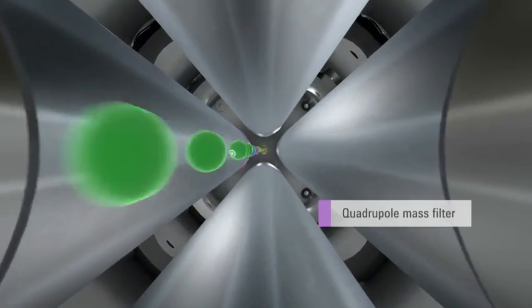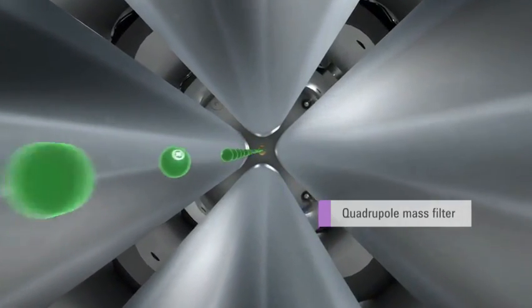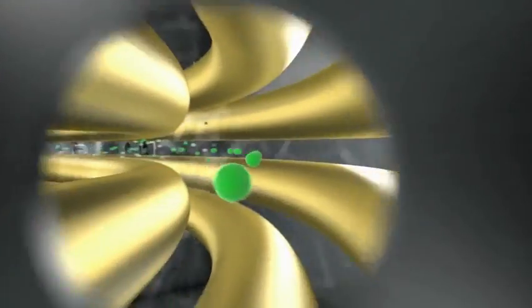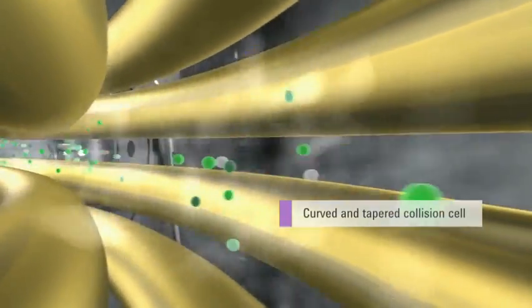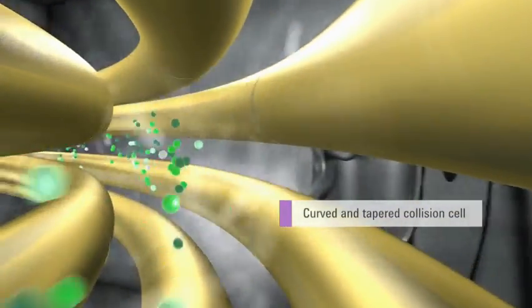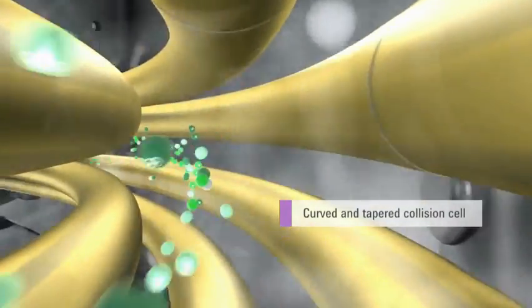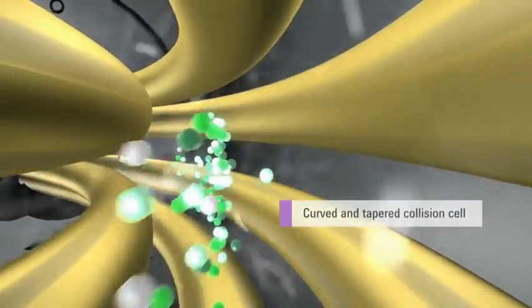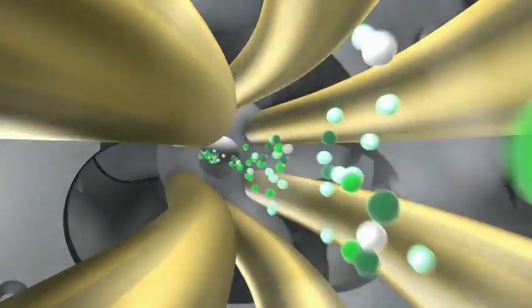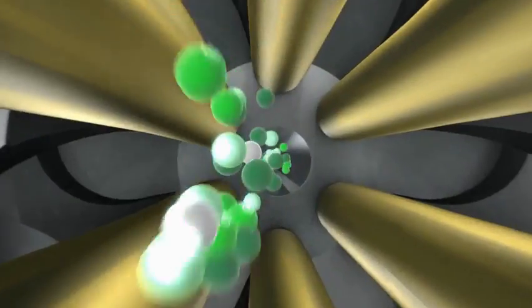The first quadrupole mass filter allows only ions of the target mass to pass through into the collision cell. The updated hexapole collision cell design maximizes ion collection and transmission over a wider mass range. Linear axial acceleration ensures fast and sensitive MS-MS without crosstalk effects, even at the fastest MRM dwell times.